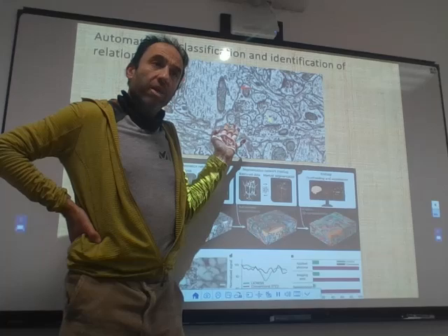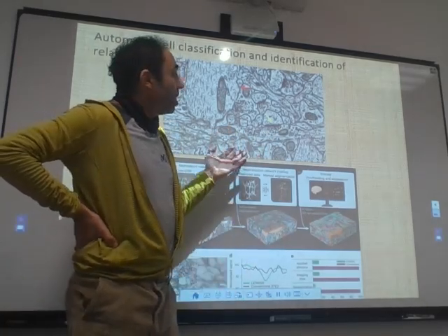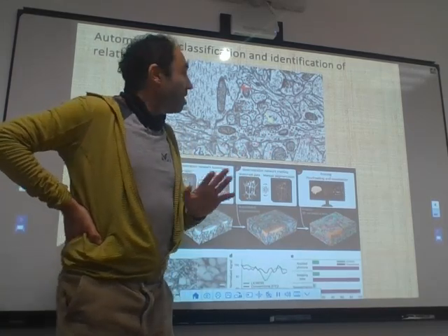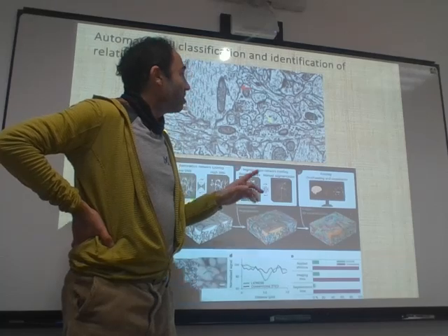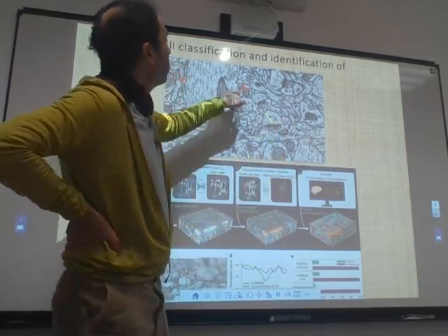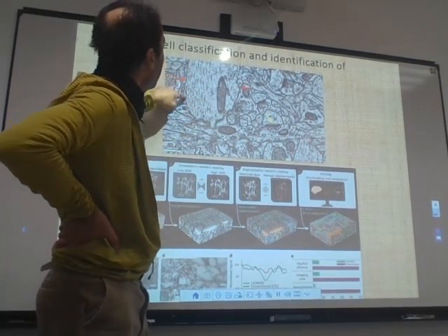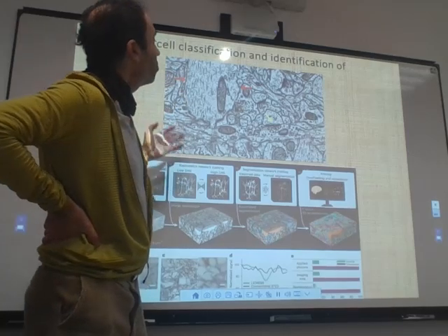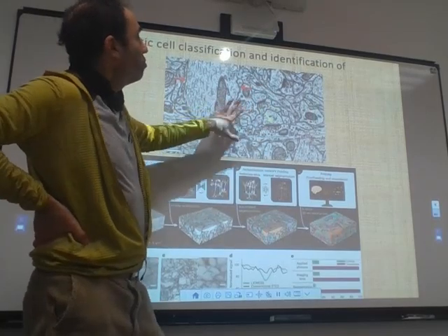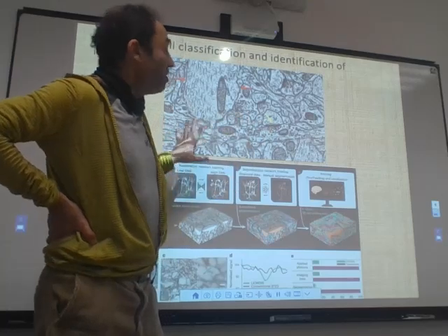There is possibly enough data now that has been generated, for sure. The annotation is something else, because this is something hard. You need a professional to tell you, for example, what is the meaning here? Here you can have maybe some kind of filaments that are associated to maybe the endoplasmic reticulum, although I don't know. We need at this point a professional to look at least from what we know.